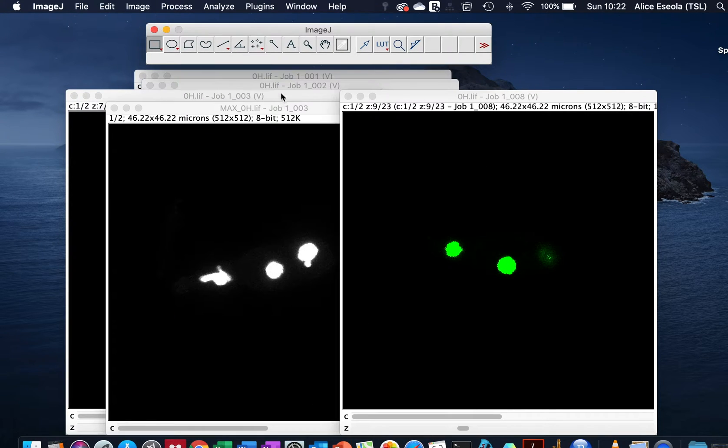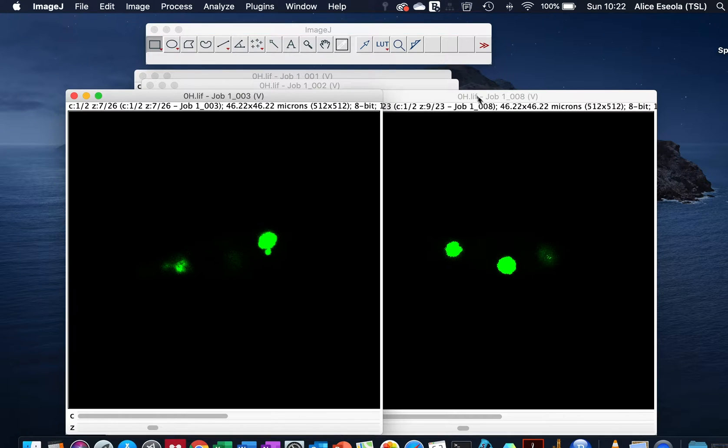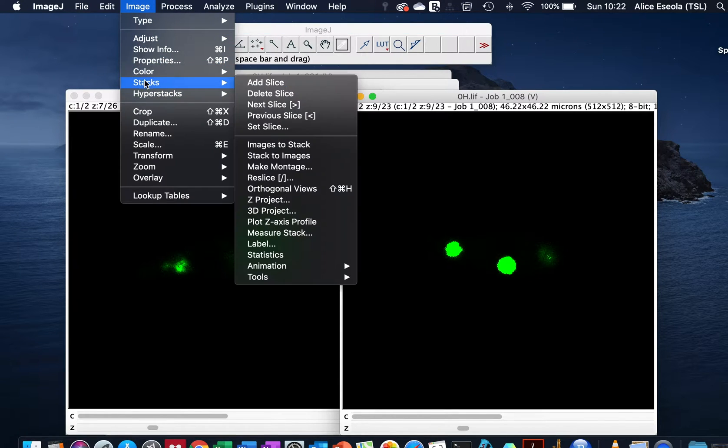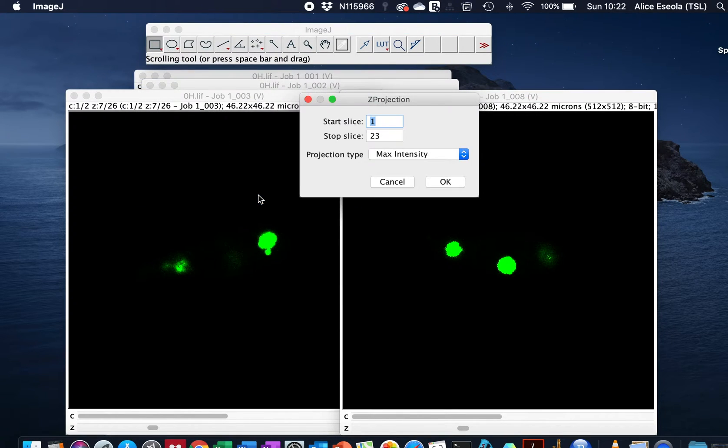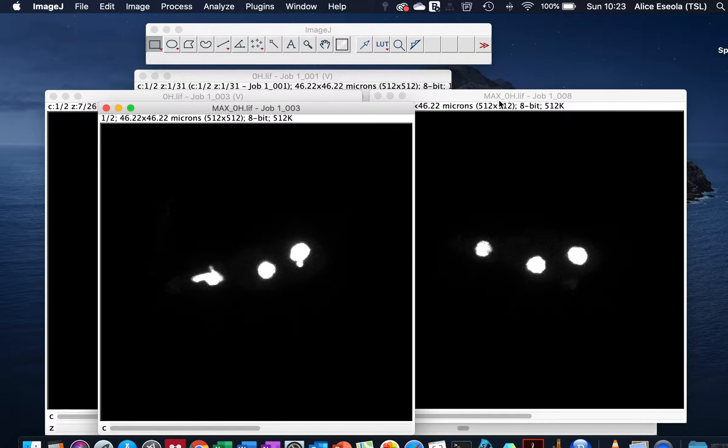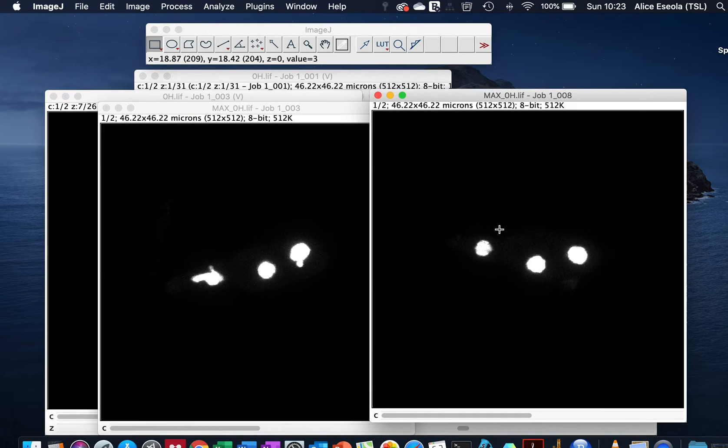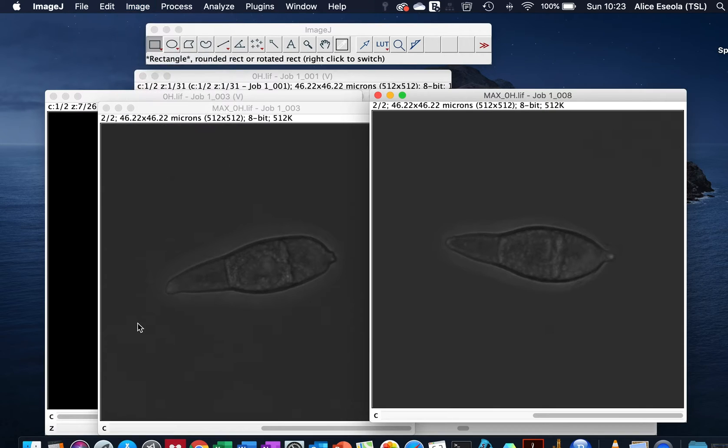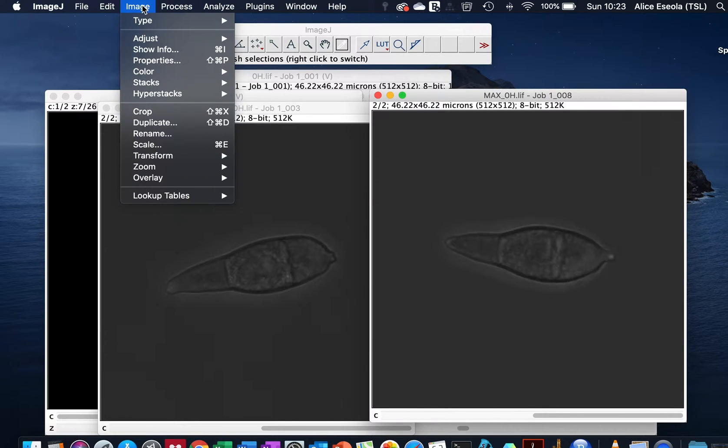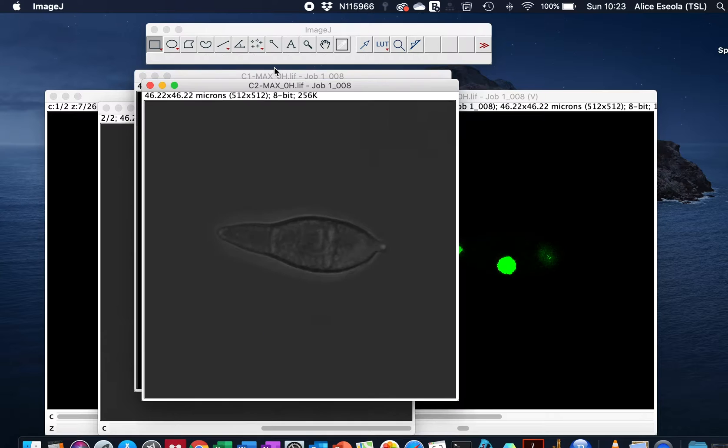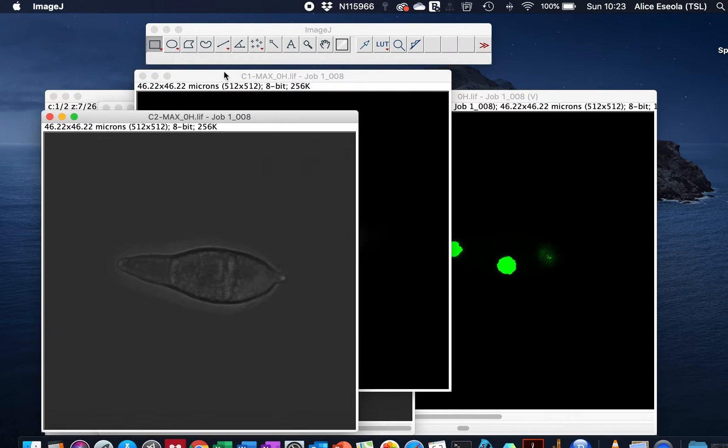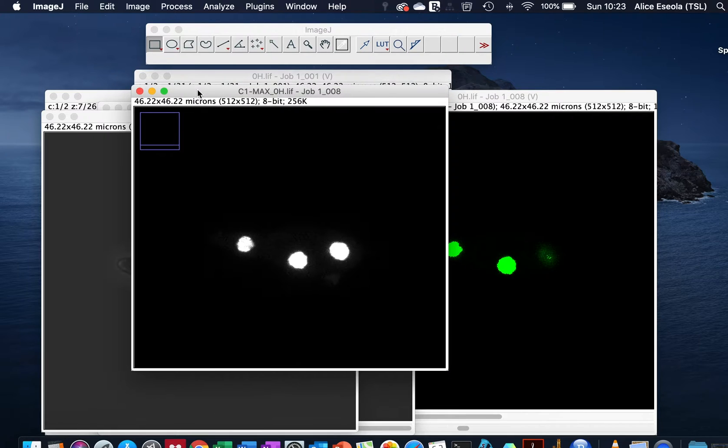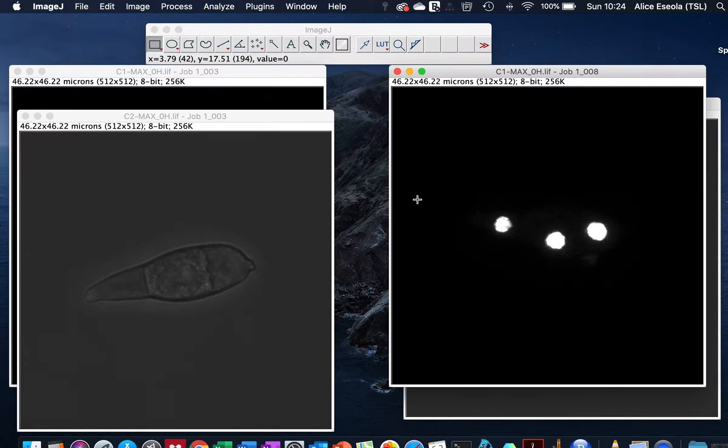So here we have a maximum projected image. For the quantification we will split the channel. To split the channel we go to Image, Color, Split Channel. Here we have a channel split into the bright field and the fluorescence field.